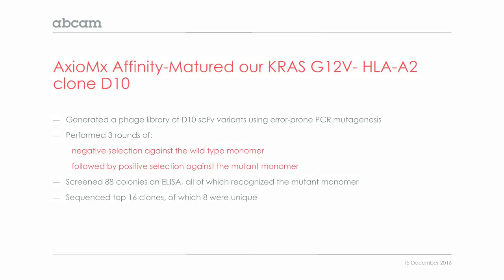So this was really promising, but we wanted to see if we could affinity mature our D10 clone. If we want to think about using the D10 scFv or full-length antibody as a therapeutic, we thought that we might need a higher affinity, given the fact that we don't think the antigen density on tumor cells is necessarily going to be very high. So we worked with Axiomx to affinity mature the D10 clone.